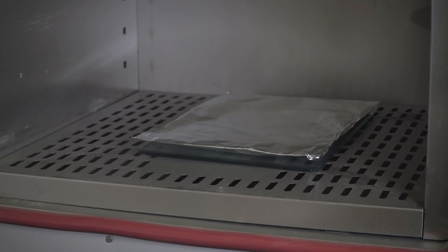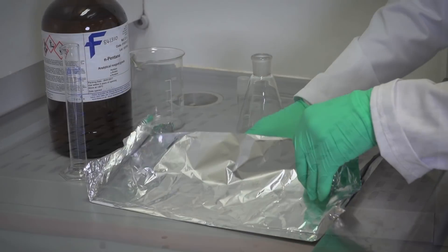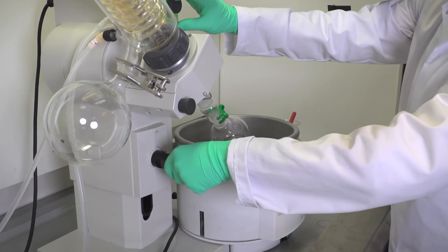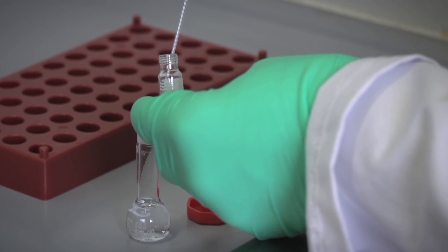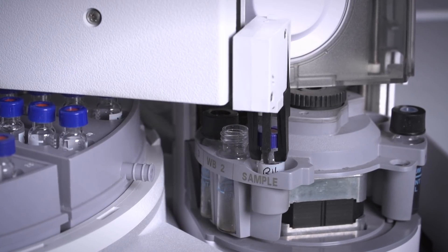Once the required amount of time has passed, we take the sandwich structure out of the oven, open up the foil and take away the food simulant or receptor. We put that into a flask and extract it with solvent. To ensure sensitivity, we concentrate up the solvent and then that extract is analysed by gas chromatography. This tells us whether any mineral oil has passed through the packaging film.